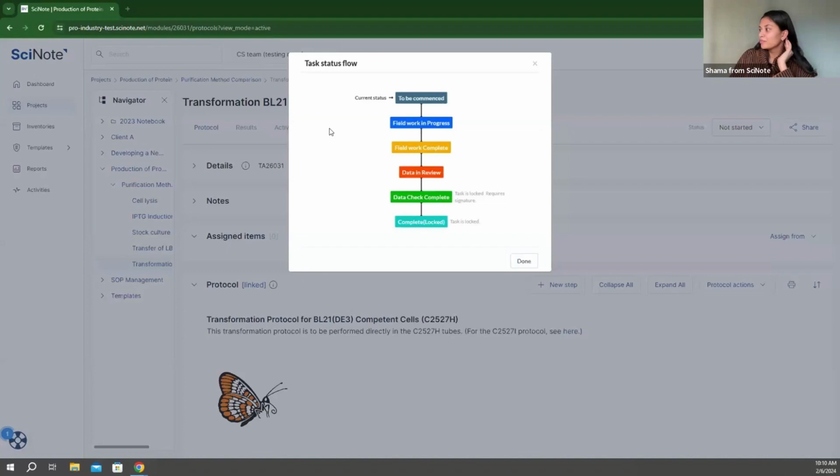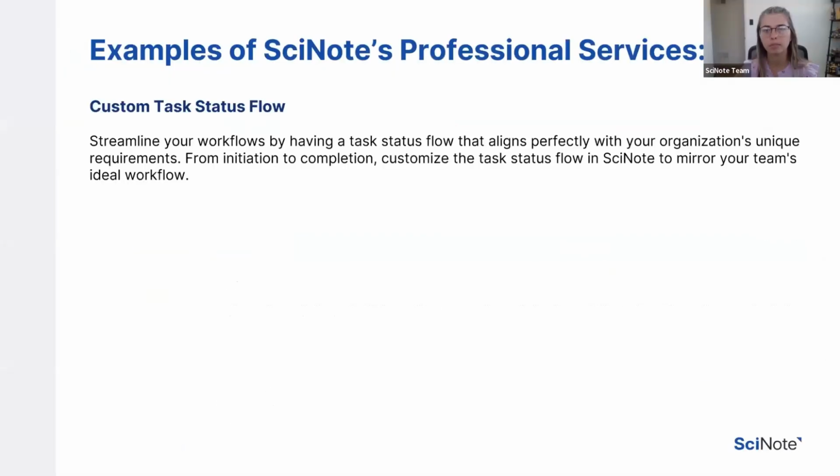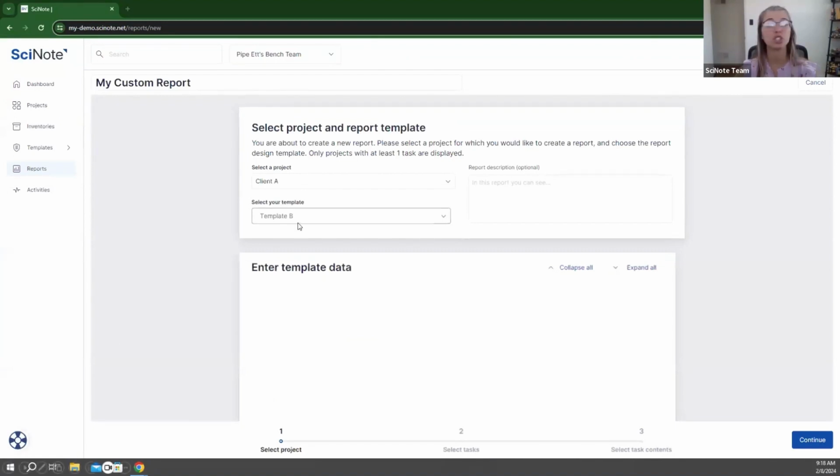Yeah. Especially, let me go back a few slides here. When we choose template B, we might have an option where it was the date completed for task or date completed for the project, and you could insert that date. So that way, when you create that report, maybe the page in the front talks about all the completed dates of the project and the tasks within.